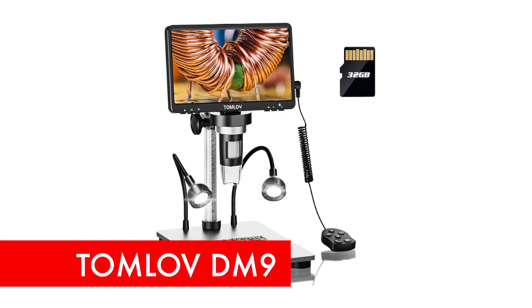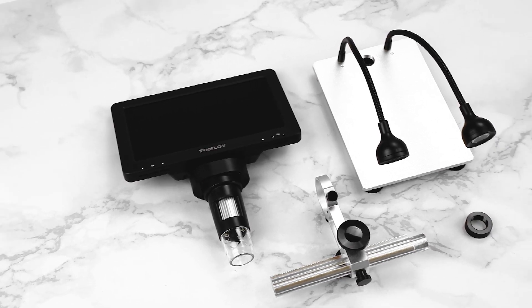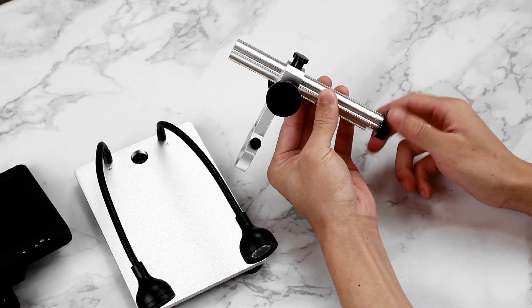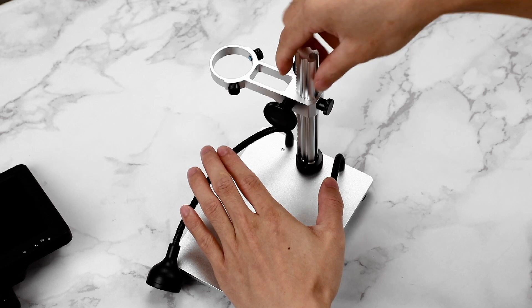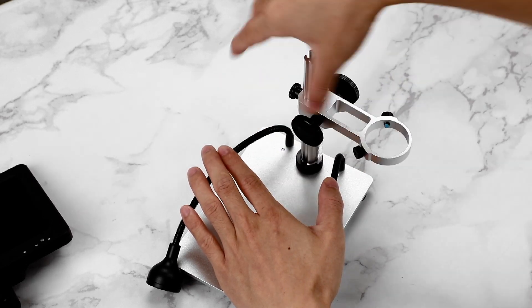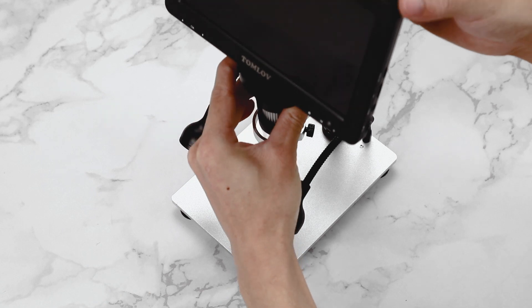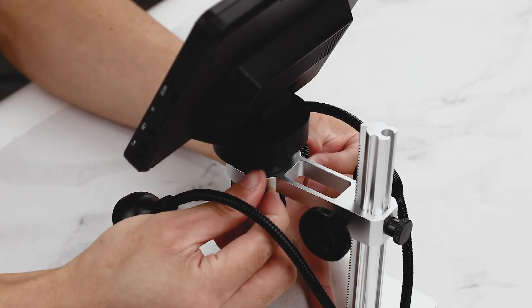The Tomlob DM9 digital microscope offers an advanced viewing experience with a 7-inch rotatable Full HD screen and a 12-megapixel ultra-precise focusing camera. Providing magnification from 5x to 1200x, it captures fine details with exceptional clarity. The 1080p imaging quality, combined with 10 LED fill lights and two additional adjustable gooseneck lights, ensures excellent illumination for detailed observations.